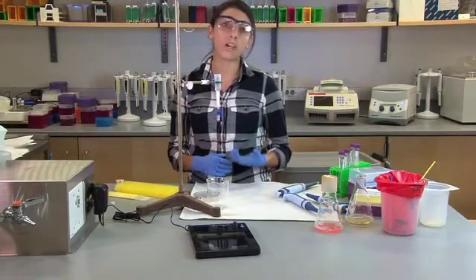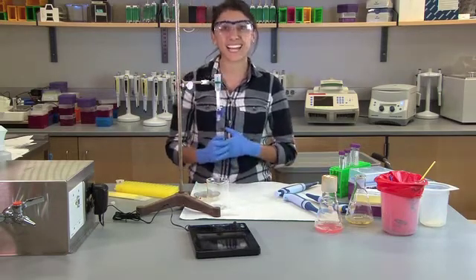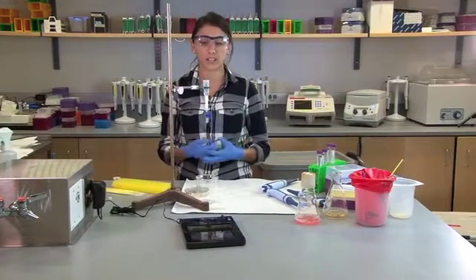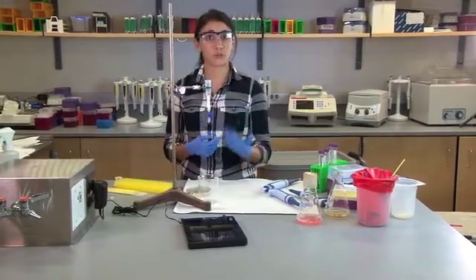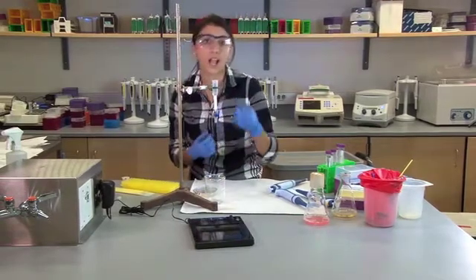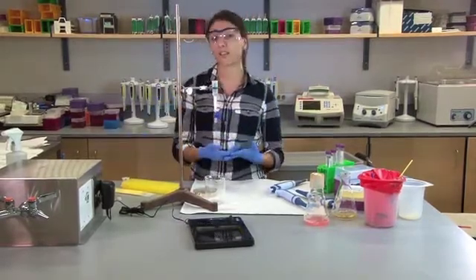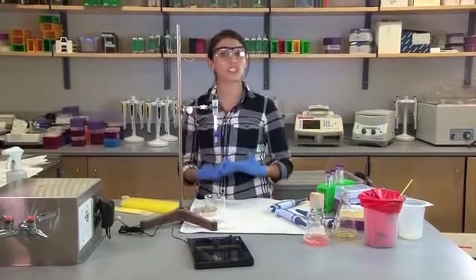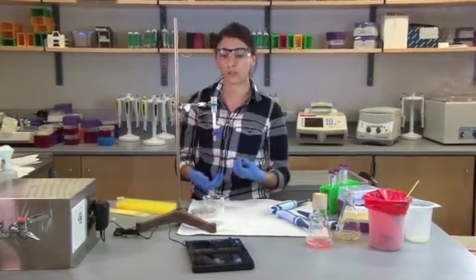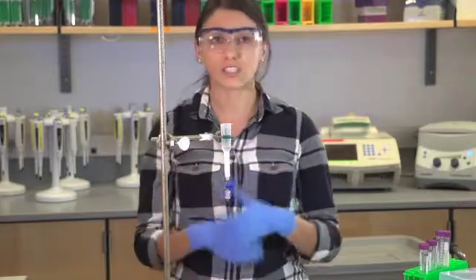Some teachers give only one tube for collection. I, however, like to give my students a lot of flexibility. If they want to collect 10 tubes of what they think their purified protein is, then great. If they only want to collect one or two, also fine. What's great about that, the students who want to collect three or four or more, I have them label their tubes and put their tube underneath their column and collect what they think is RFP. Once they have their four plus tubes of their collection, we have them put those tubes on the light, and before we turn the light on, we have them guess which tube has the most purified protein. And sometimes they are able to figure it out because, you know, RFP is pink, and so their tubes of solution will have a pink tint, but sometimes not so much. And they're amazed when we turn the light on, the fluorescence just surprises them. So they may think it's tube one because they think they're getting all the pink, when in reality, it's tube three.